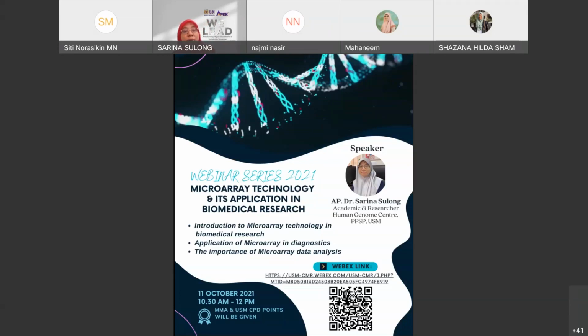We do have a microarray specifically for epigenomic studies. If you want to see the epigenome, we call this a methylome, if you want to see the hypermethylation profile in the whole genome. There is a specific array for that. So in epigenetics, there are no DNA changes. With a point mutation, of course, there are changes, but in epigenetics your DNA sequences are normal and only the expression is abnormal.